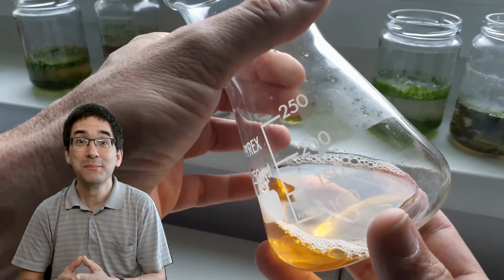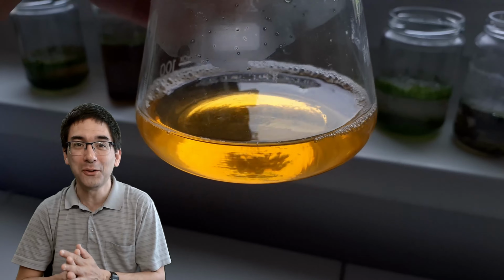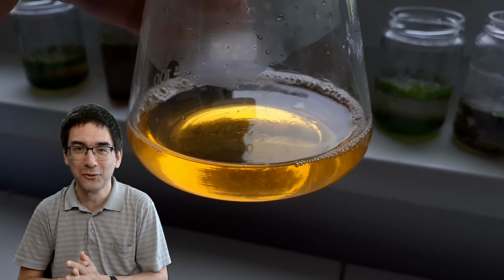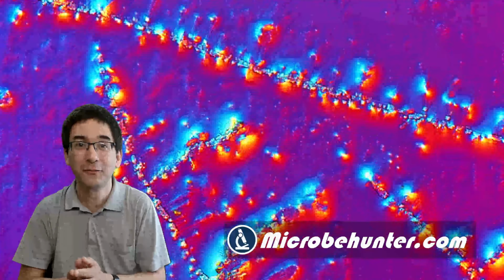So this here is my urine, and today I'm going to put this urine under the microscope because it really looks beautiful. Hello and welcome, Microbehunter here. Who would have guessed that urine is able to produce these beautiful and colorful patterns?